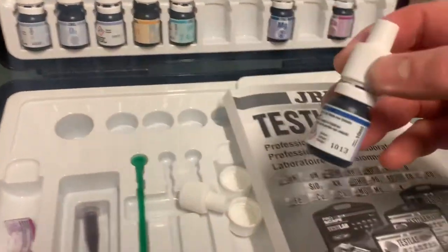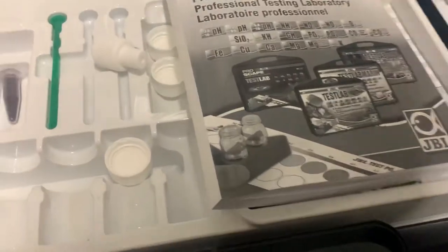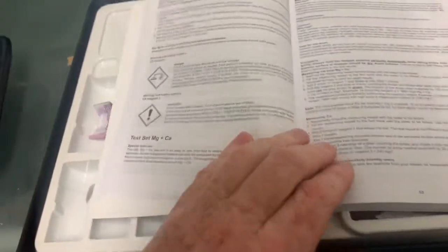I'm going to put Magnesium 2 in one drop at a time until I see the color change. This is a titration test, so I'm waiting for the color to change — it's not a colorimetric test. I'm not comparing a color; I'm just waiting for it to go from red to green.